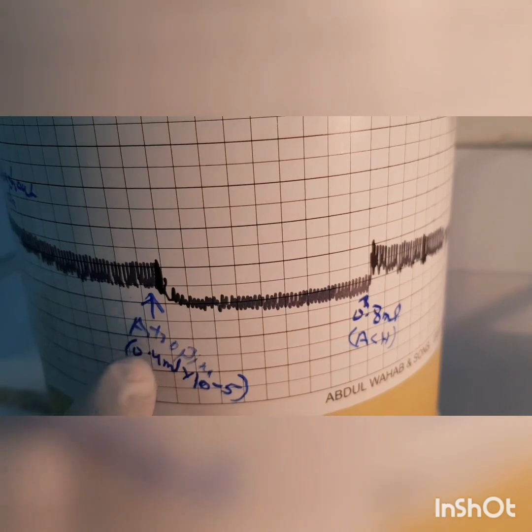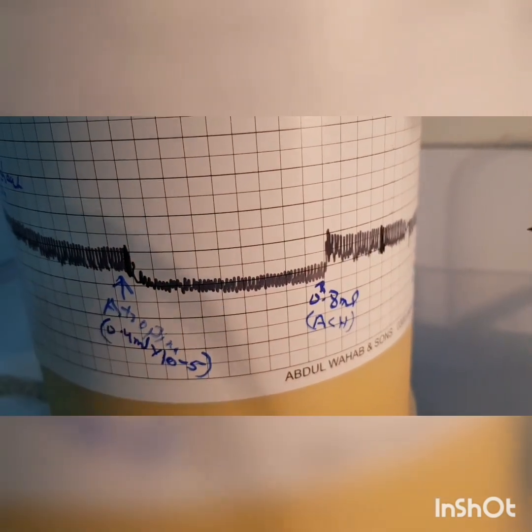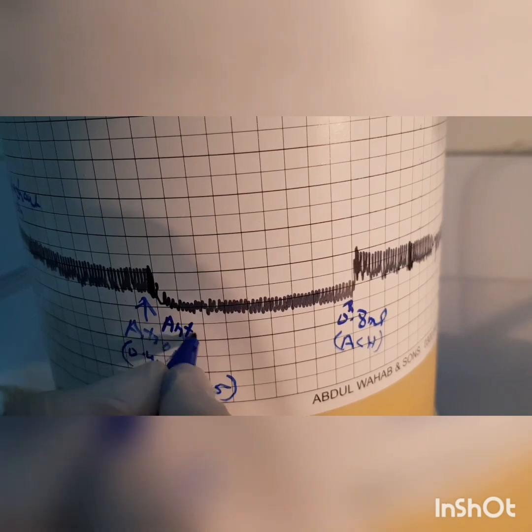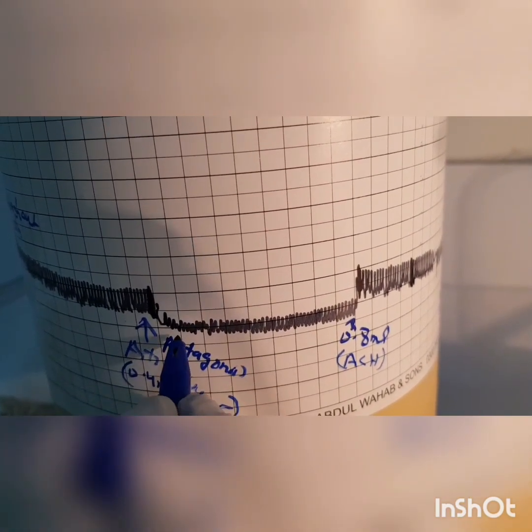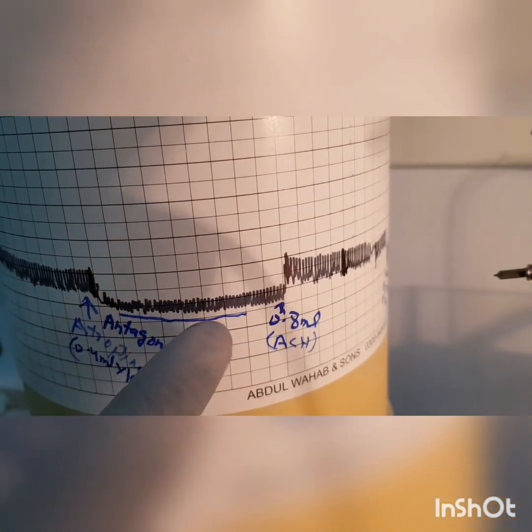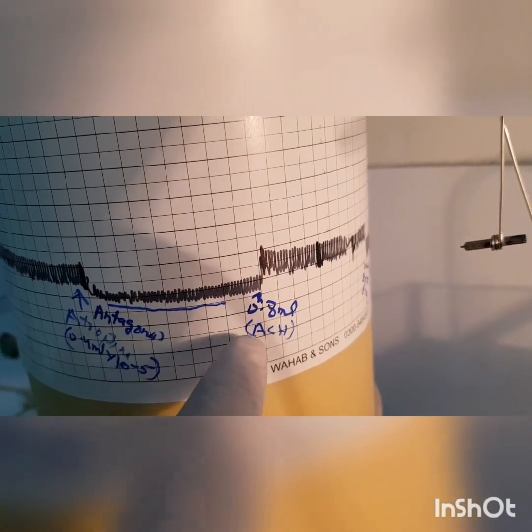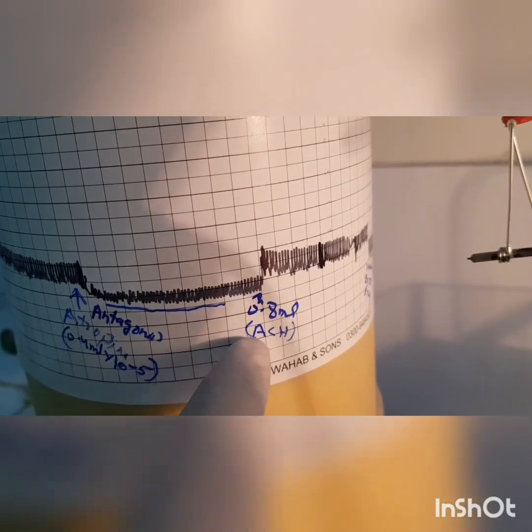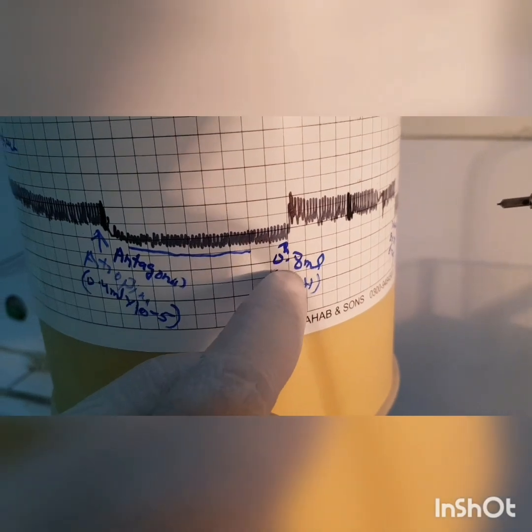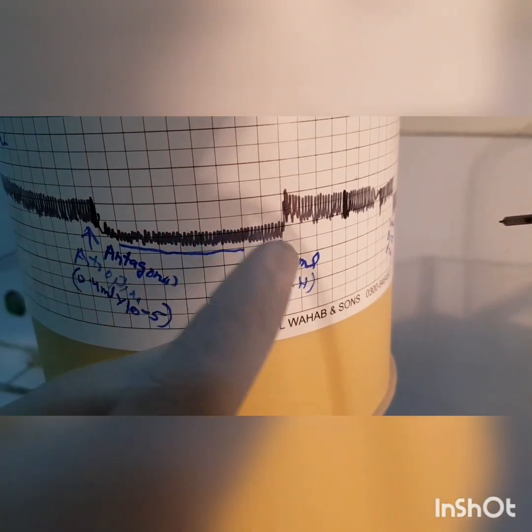Atropine is used here as an antagonist. And this is the effect of the atropine. Atropine binds to the muscarinic receptor. Again we give agonist, which is acetylcholine, and the dose is 0.8 ml.